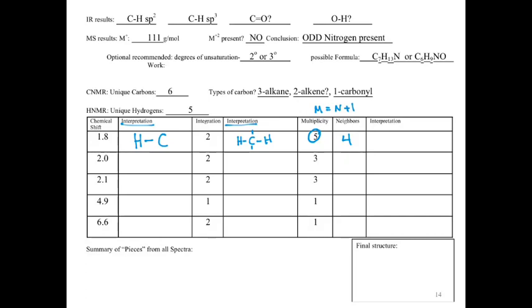We can't just attach a methyl group. So if we looked at a possibility here, I'm going to rotate it slightly. I can't just put a CH3 on there. We'll specify this as a different color, because that CH3 is only 3 hydrogens and I need 4 neighbors. Well, let's just put on an extra hydrogen. Oh, that's right, we can't do that. So what this means is ultimately 2 possible conclusions out of this.